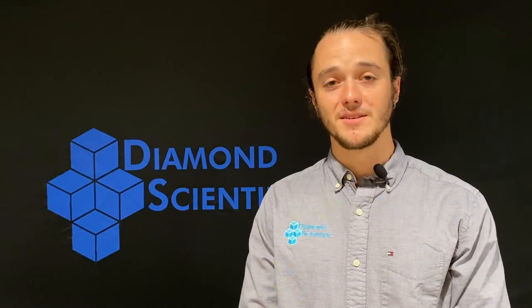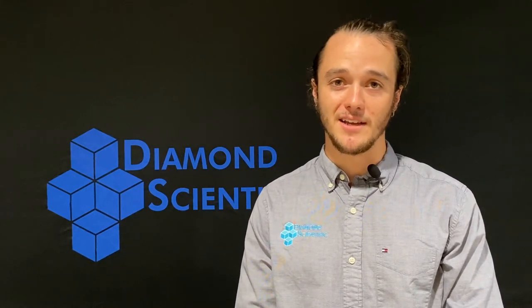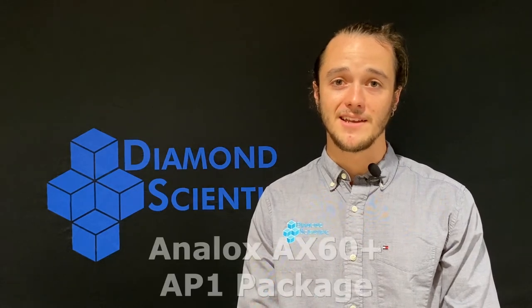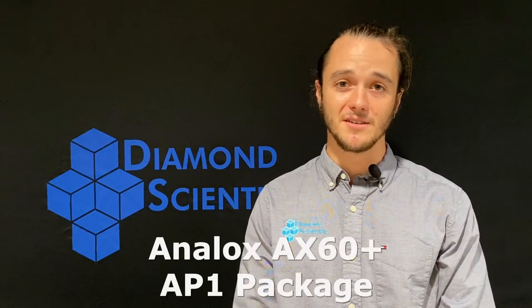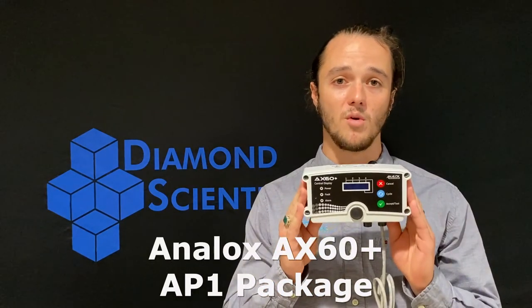Hi everyone, thank you for tuning into the Diamond Product Series. My name is Shane with Diamond Scientific, your go-to for biogas analyzers, pumps, and accessories. Today we're going to be going over the Analox AX60 Plus safety system — specifically, we'll be going over the components of our US AP1 package.